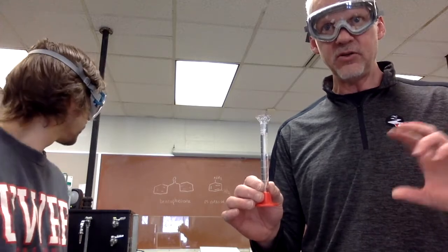We still have the 20 mils of the organic layer in the separatory funnel, and we're now moving on to the next phase of the acid-base extraction, where we are adding the 1 molar HCl. Yep, so it's a very similar process. We'll start with 10 milliliters of 1 molar HCl, shake, vent, drain that out. Then we add 10 more milliliters of 1 molar HCl, shake, vent, drain that out. And then we add 5 milliliters of water, shake, vent, and drain that out. So we'll wind up with 25 milliliters of aqueous acid in a separate Erlenmeyer flask. And we'll report back when we get that part done.